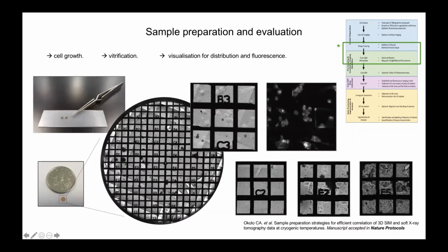And in it, you can see little cells that are growing on top of the support film. Now, these are G2S cells and from one of our projects. And you notice that we have a fair distribution. They have company, so you don't have a single cell anyway. They're nice extended geometry, some of them, and then some of them have fluorescence also. So this is the same area in fluorescence.